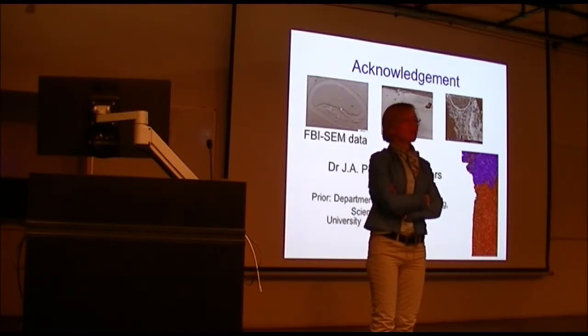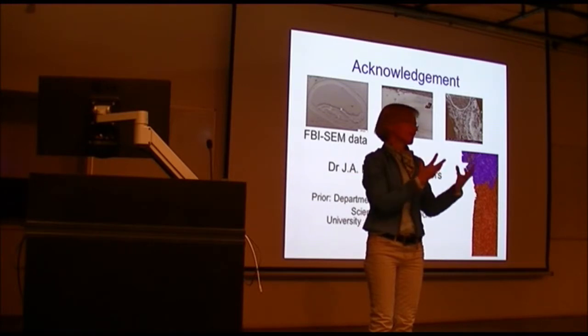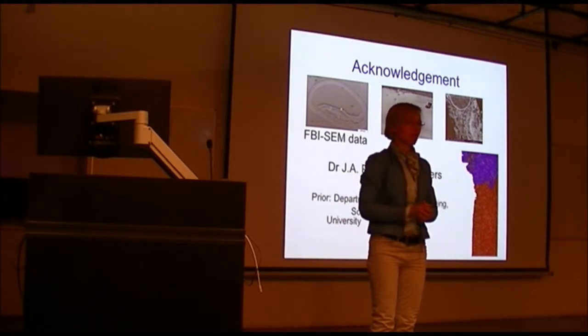And of course we also do a lot of research on cultured cells, but then it's a selected group of cells. So a lot of in vitro experiments are done as well.